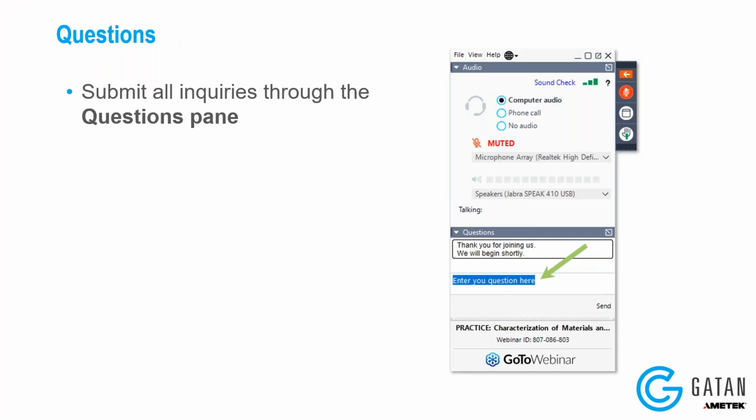Thank you very much, Ben. Nice presentation. There are a few questions actually, so maybe I will just dive in. One of the things that you mentioned a couple times was that we need to be careful how we set up the camera and the microscope when we collect diffraction images on Metro. Can you elaborate on that, please?